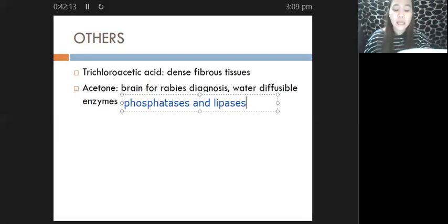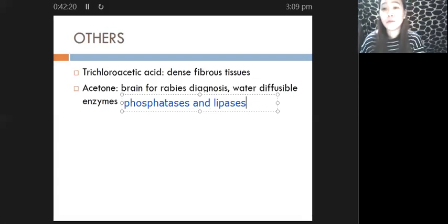So your acetone is utilized at very low temperatures. In particular, we utilize it at -5 to 4 degrees Celsius. So why do we have to utilize it at lower temperatures? This has something to do with the volatility of your acetone. Remember that volatility of your substances increases with increased temperature. Volatile substances are capable of evaporating at low temperatures, right? Evaporation of your substances should happen at higher temperatures.